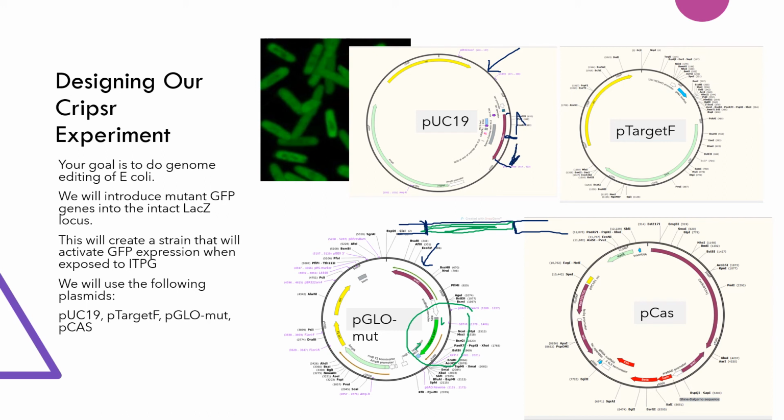Okay, so we're turning pUC19 into a linear molecule by amplifying at our cut site. We know where it's going to cut when we do CRISPR, and that's where we want to introduce the GFP. So we're going to use PCR to amplify at the cut site, but going in the opposite direction. So now think of opening that pUC19 up into a linear molecule at the same place our guide RNA will eventually cut in the E. coli genome.